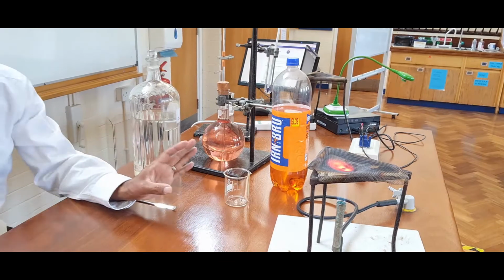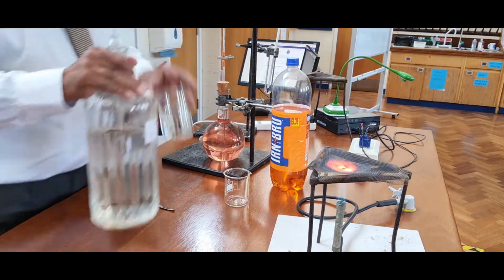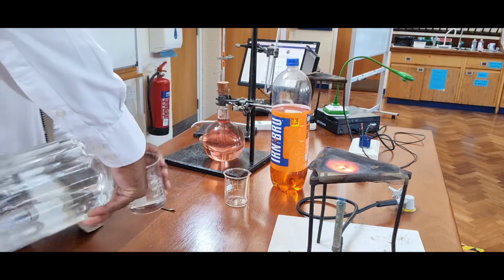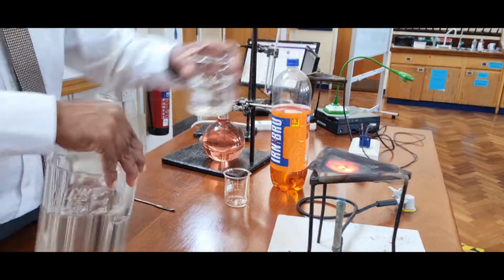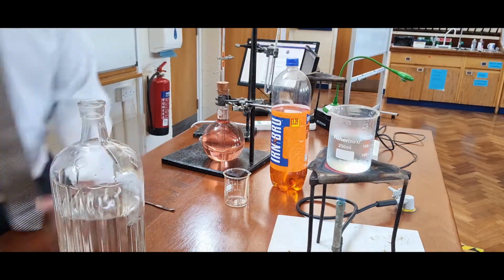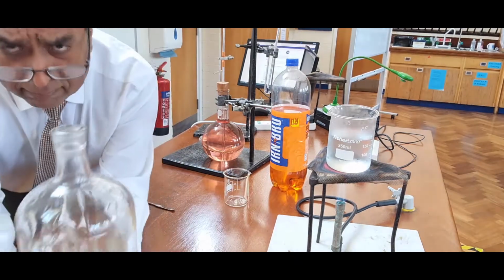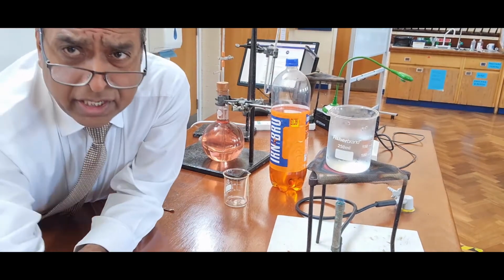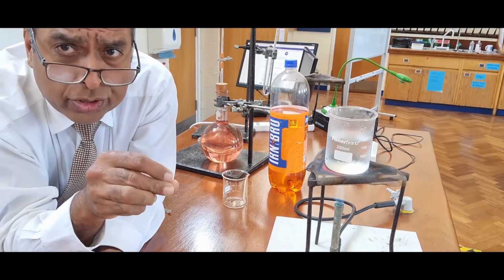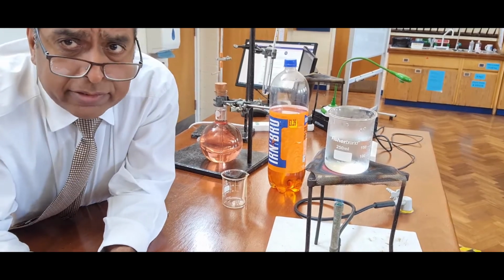Now, I want to get some water being warmed up. This is distilled water. I'm going to warm that up. Now, solubility curves. Solubility curves tell us how much solute dissolves per 100 grams of solvent.